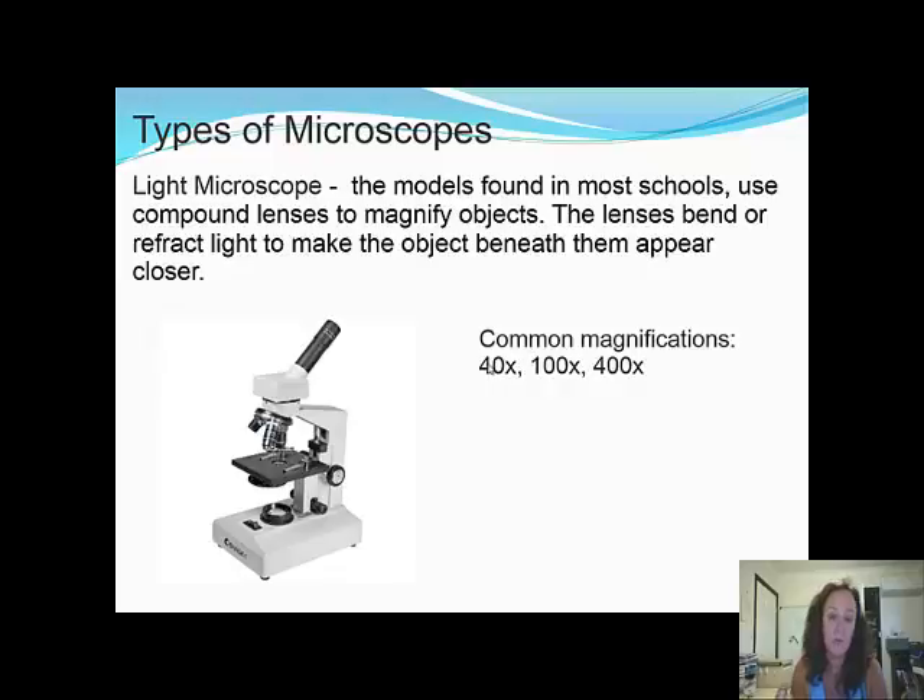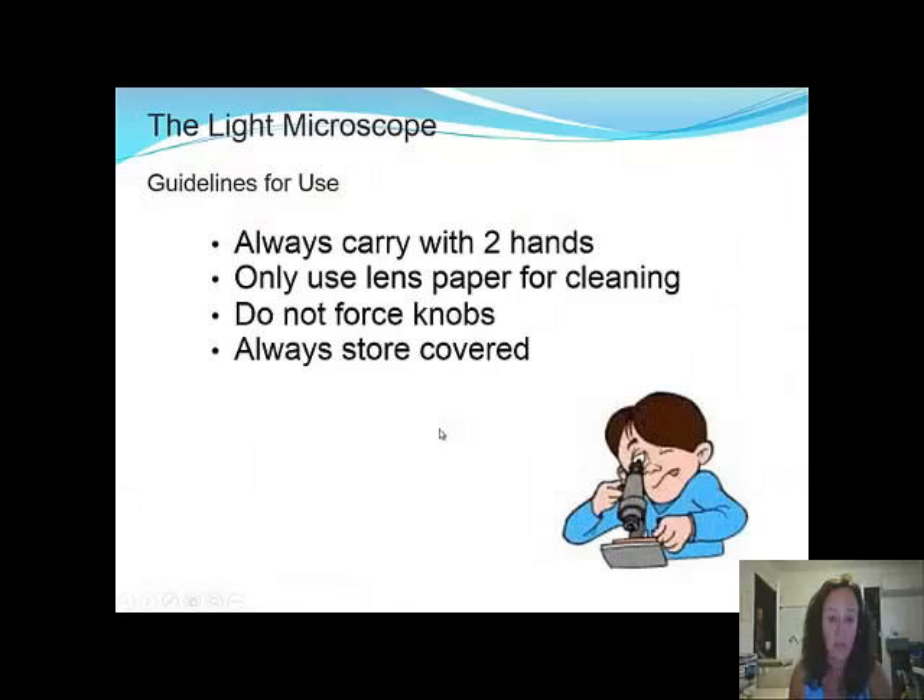Always carry the microscope with two hands — one on the arm and one under the base. Use only lens paper for cleaning. Do not force the knobs if they feel stuck, and always store the microscope in a covered place.